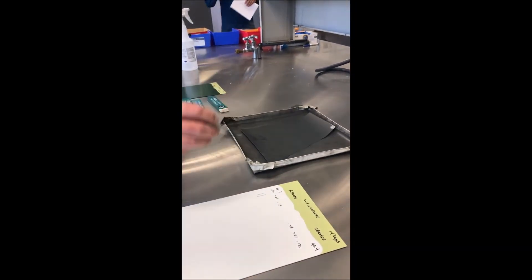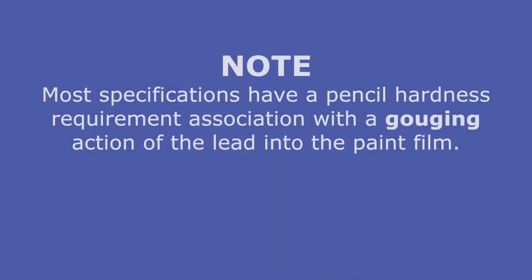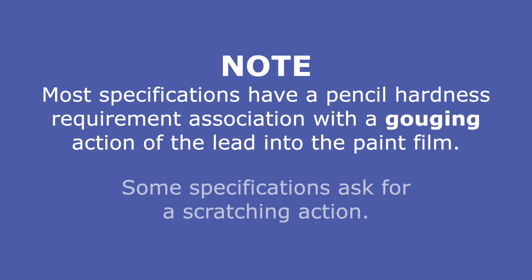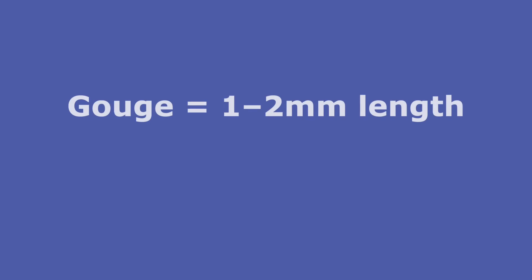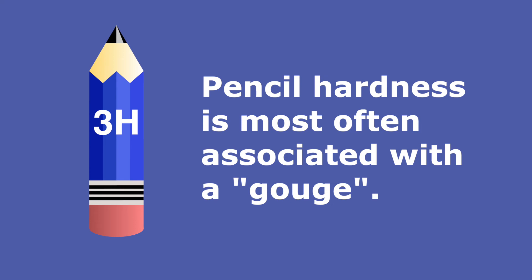Repeat this process until a pencil has been selected which gives the alternative result. Note: most specifications have a pencil hardness requirement associated with a gouging action of the lead into the paint film. Some specifications ask for a scratching action. The main difference is the length of the stroke of the pencil. A gouge is produced with a very short stroke, perhaps one to two millimeters in length, whereas a scratch requires a much longer stroke, perhaps as much as one inch long. The pencil hardness value is most often associated with a gouge rather than a scratch.